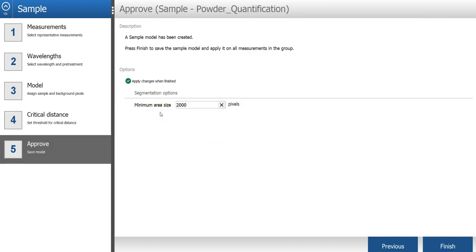In the last step of the sample model wizard, I can set a minimum area size that is used to automatically exclude smaller unwanted objects, for example, dust or dirt in my images. In this example, all objects under 2000 pixels will be excluded from the image, which is fine.